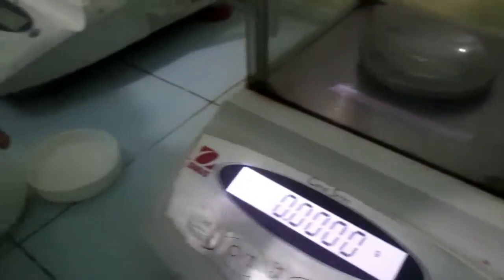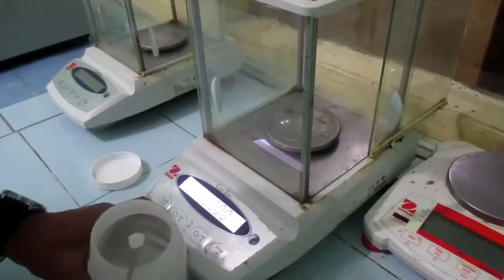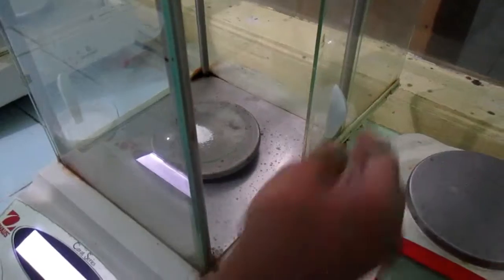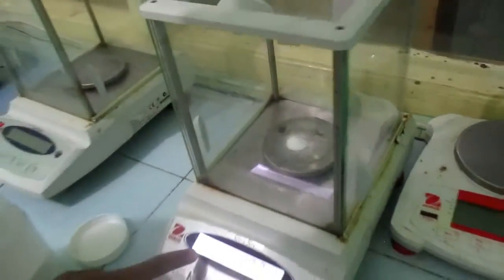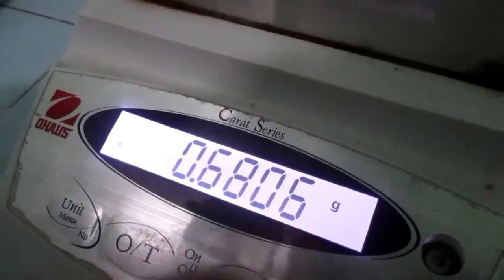After that, we can weigh the chemical solid. Open the glass door and take the chemical solid using a spatula, then place it on the watch glass. Close the glass door and wait for the analytical balance to stabilize. Once the star mark appears, the analytical balance shows us 0.6806 grams.